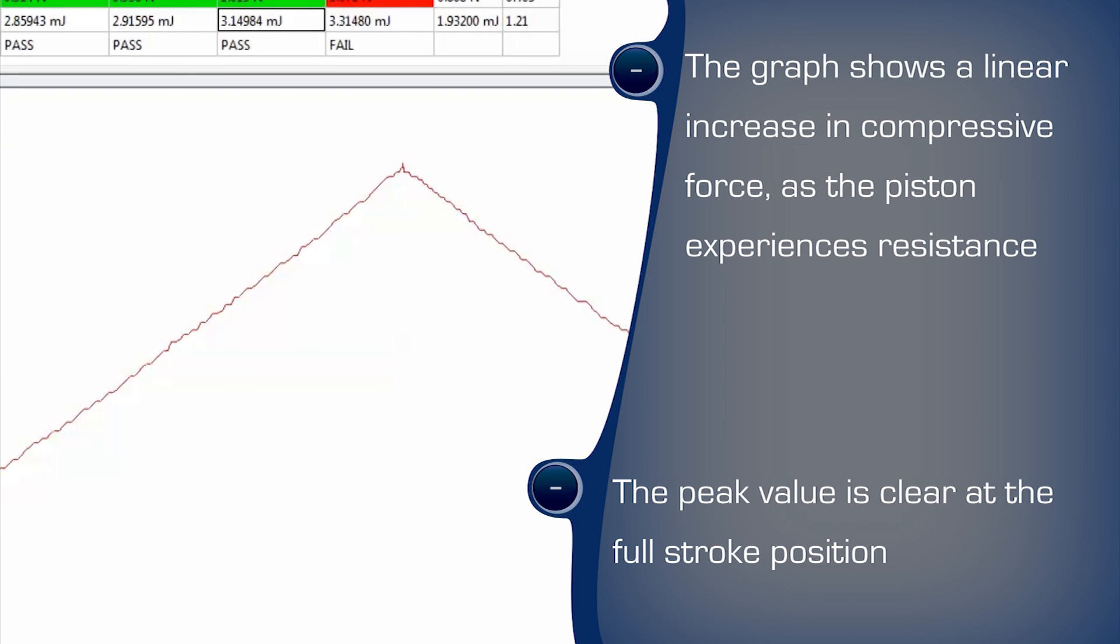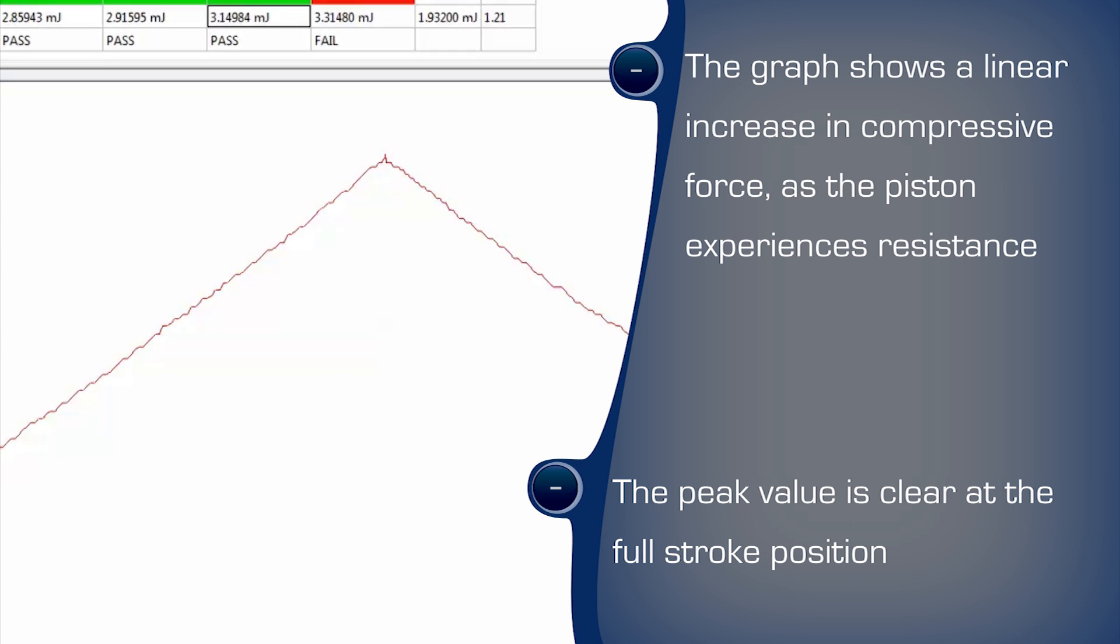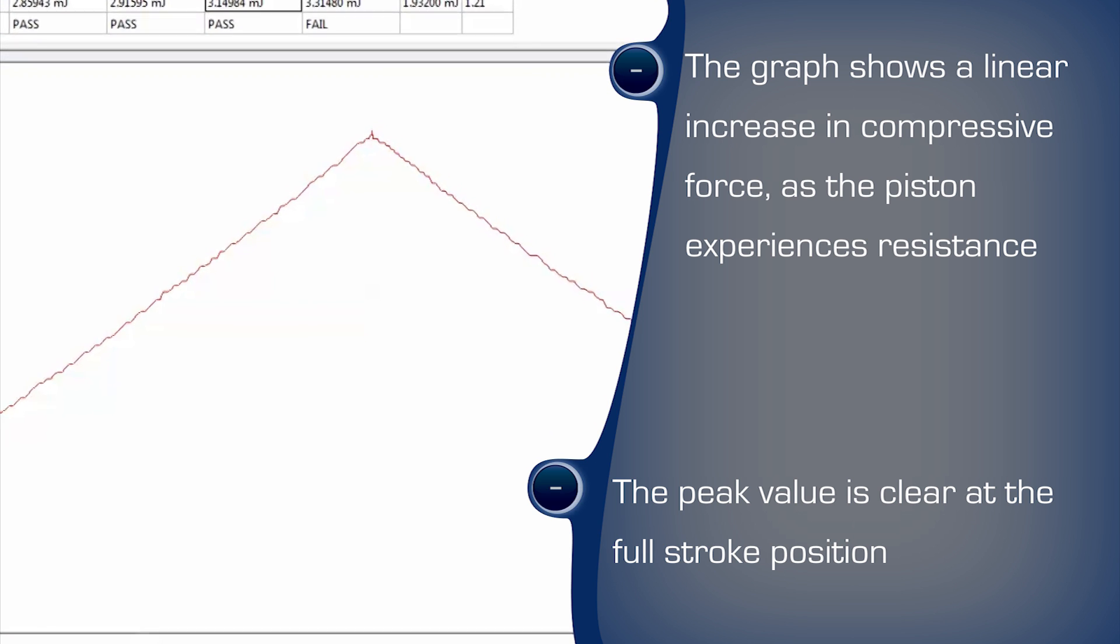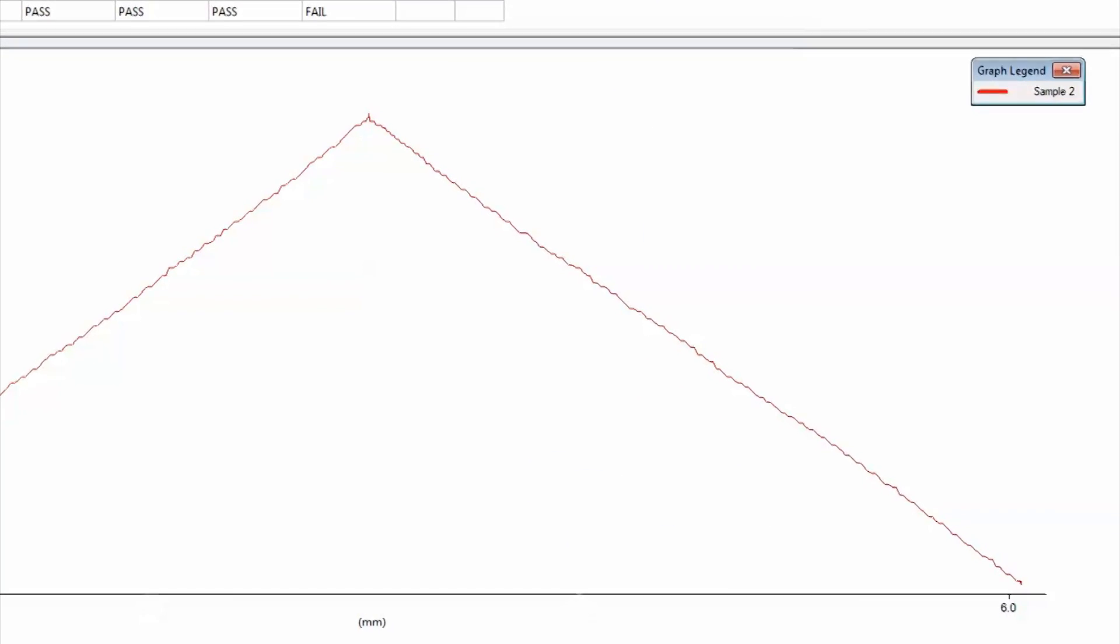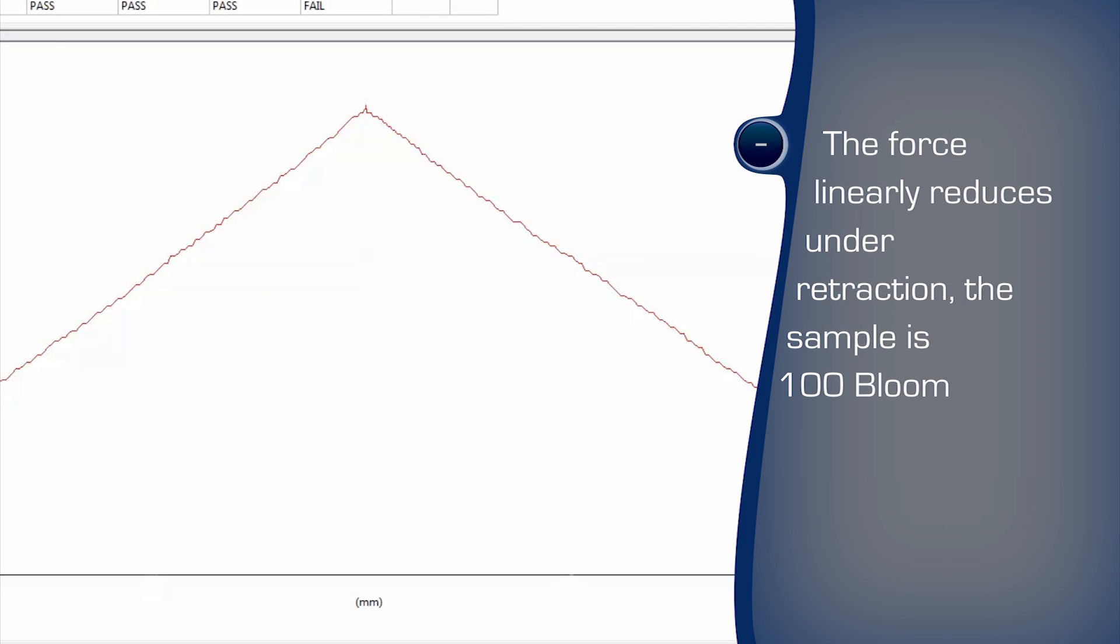The TMS software clearly displays the results, which can quickly indicate any out-of-specification samples. The peak force in grams is the recorded bloom strength.